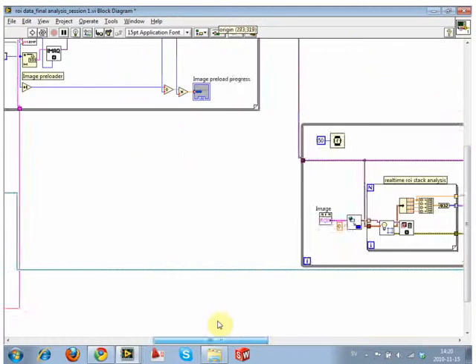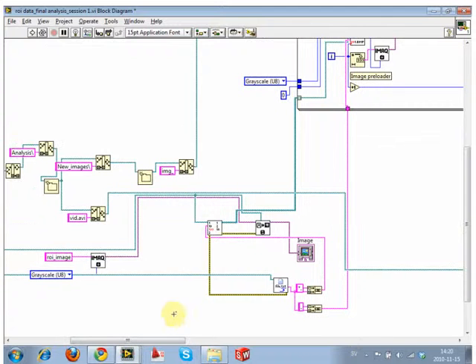So what else could be wrong? We could have tacked together something over here so that we're filtering wrong. So we're going file out, arrow out into there. So we could be filtering our file names wrong. So let's just check. And we can check right here.